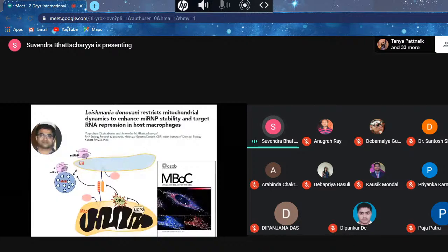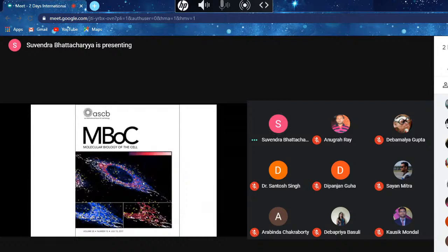You can see the images. If I go to the images, you can see these different colored structures. He used an image processing platform, Imaris, to highlight the interaction points, showing how these different ER, mitochondria, and endosome structures interact with each other. Some of the strong interaction points are shown in different colors.